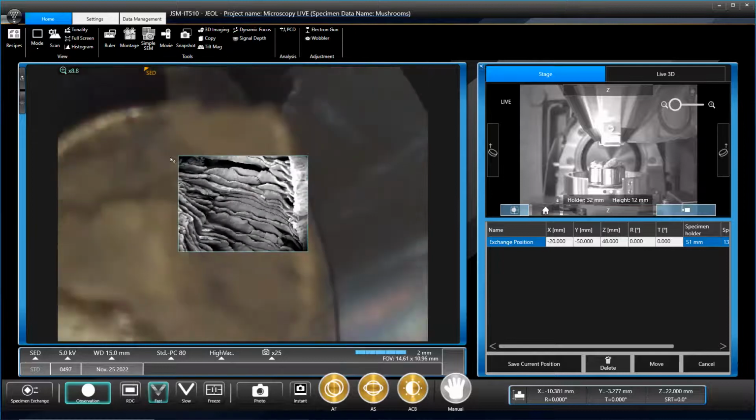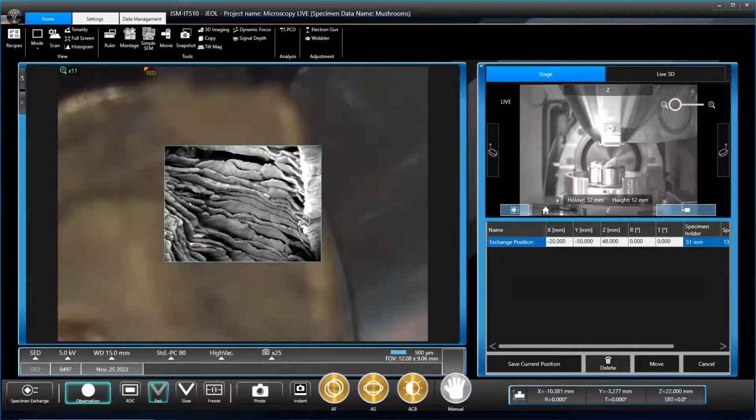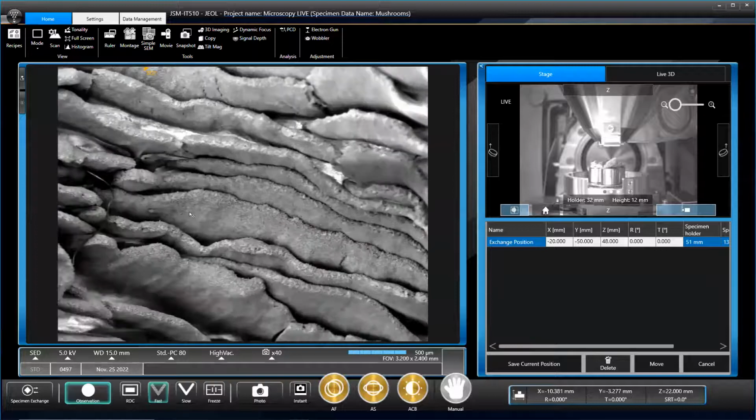So what I've done is I freeze dried some mushrooms, and we're looking at the gills mostly because they seem like the most interesting bit. There is a little bit of regular mushroom flesh on those as well. So we freeze dried them, so we've taken all the water out because water doesn't like being electrocuted, and then we've coated them in gold to make them nice and conductive.